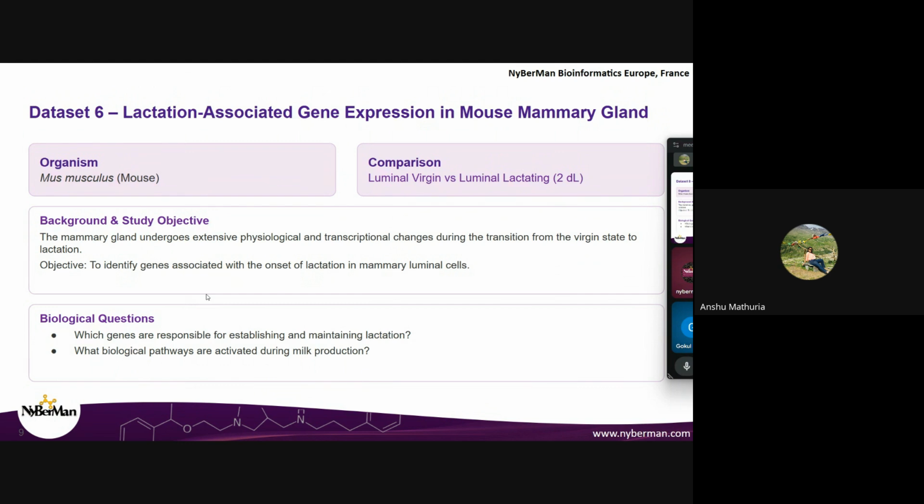You have to identify those particular genes and establish that they are being maintained in the lactation process. And then you also have to tell me the biological pathways that are getting activated. For all the analysis that you're doing, first you need to understand the highly expressed and the lowly expressed genes. Based on that, you will understand which genes are involved. After that, you move on to the functional enrichment part, where you tell me the pathways in which they are involved. If a gene is deleted, what pathways are going to be affected? All of that information is to be given properly.